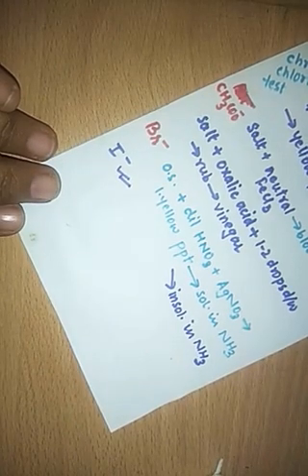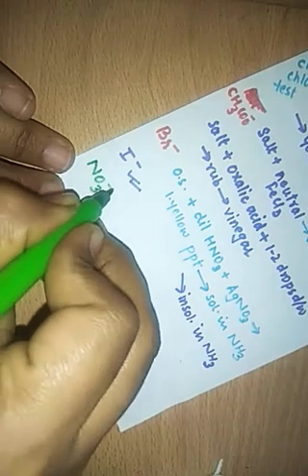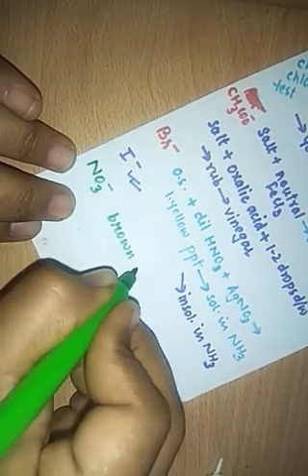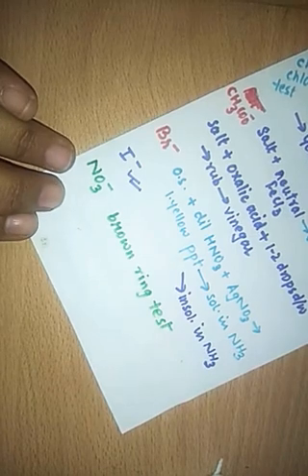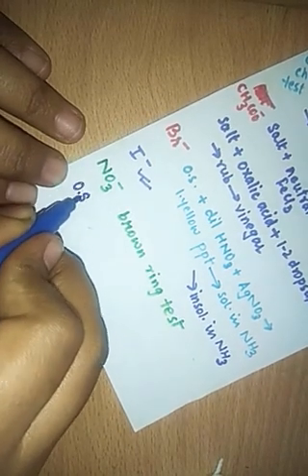Now the next one is for your nitrate ion, a very important one, because this also has a specific name called the brown ring test, right? So what we do in this test, we take the original solution.